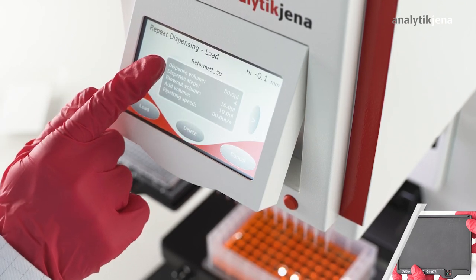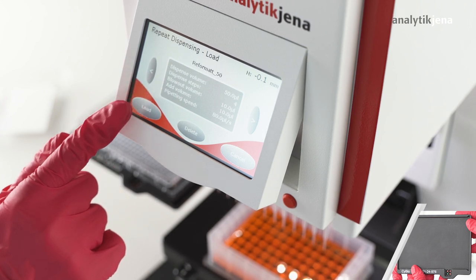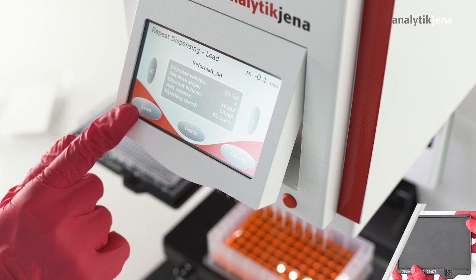The already individually created and saved method is loaded. In this example, an add-on volume of 10 µL is used and 50 µL liquid is dispensed in each of the four quadrants.